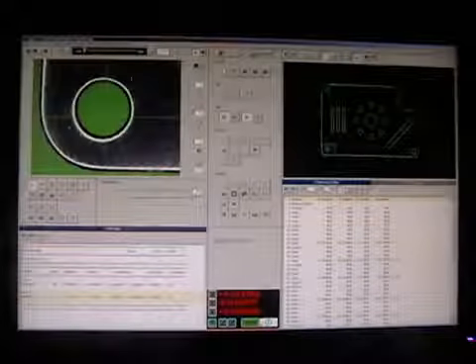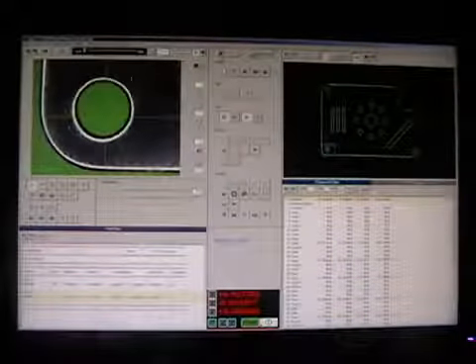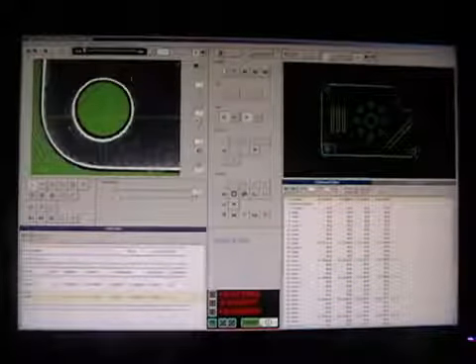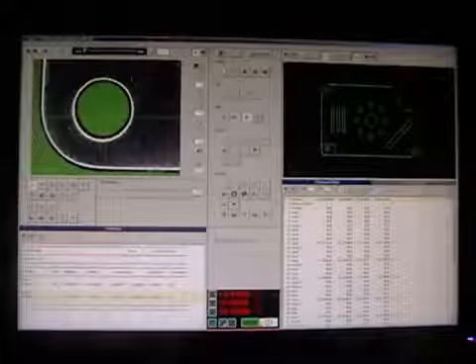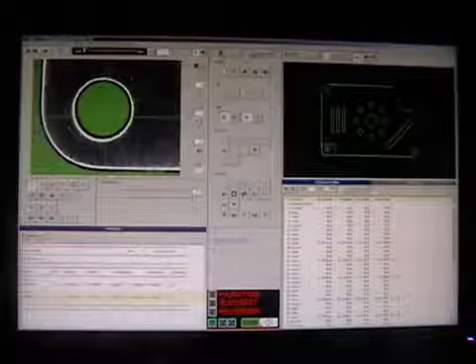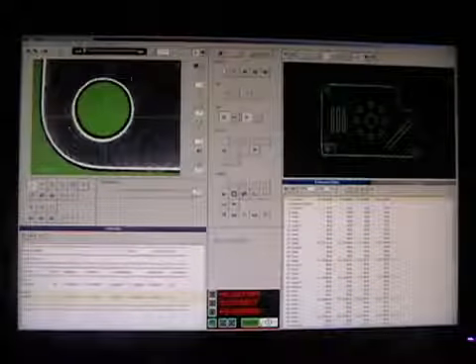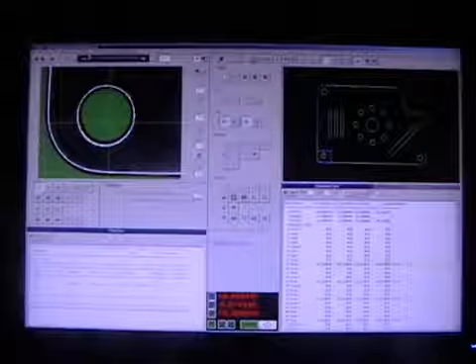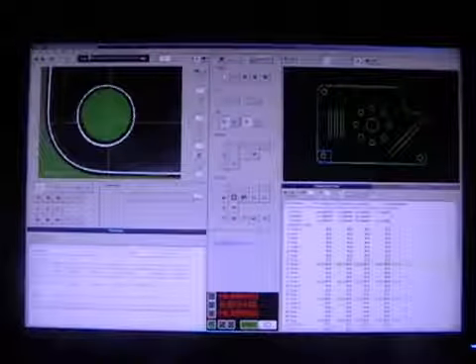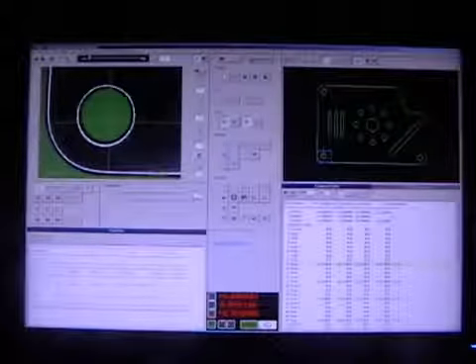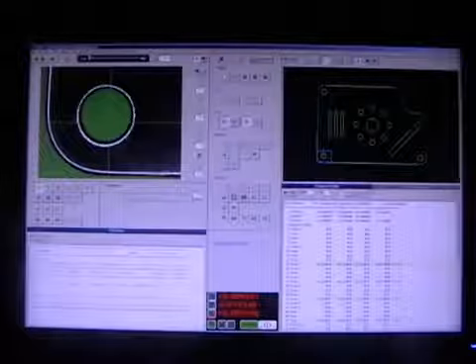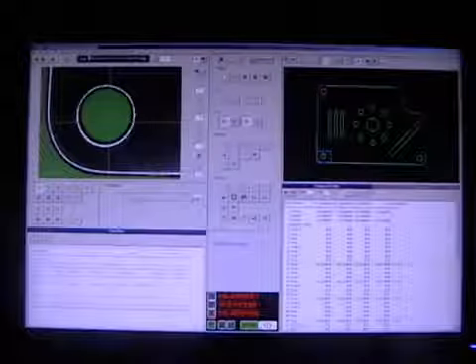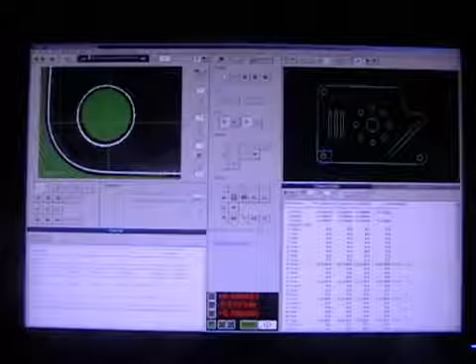Moving upward here to this tool box, this is the main operational tool box where the interactions with the system typically take place: saving files, running programs, inserting, editing, also changing units. For most things in the system there are multiple ways to achieve them, for example the inch metric change here as opposed to the inch metric button in the software down here as opposed to the inch metric button on the front of the system itself. This just enables each user of the system to interface with it in the way that is most comfortable for them. The central area of the tool box provides icon access to the different functions, measurement and construction functions for calculating the different geometries and parts of our inspection routine that we want to report.